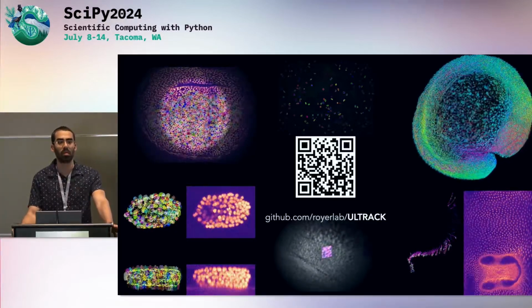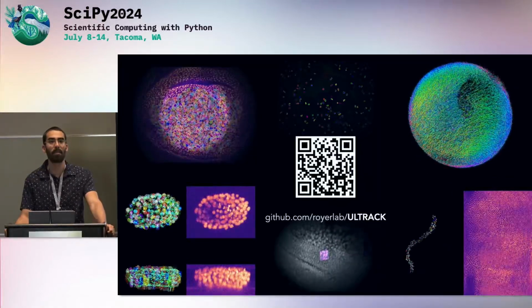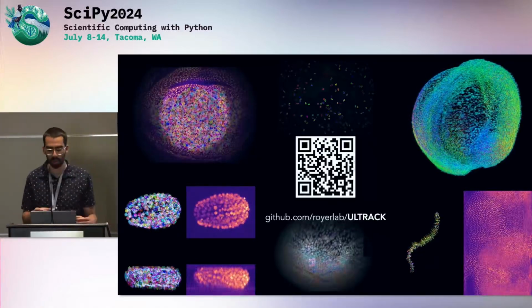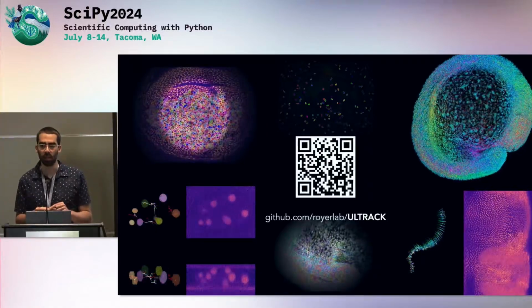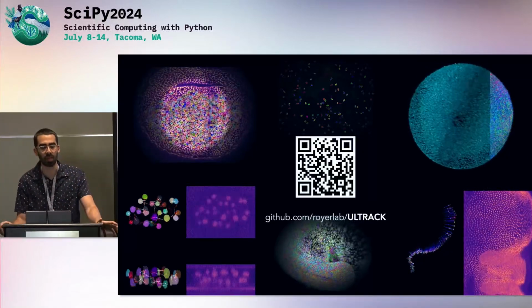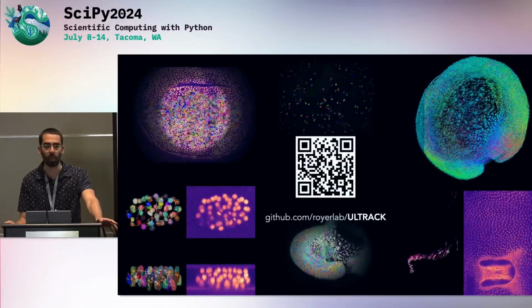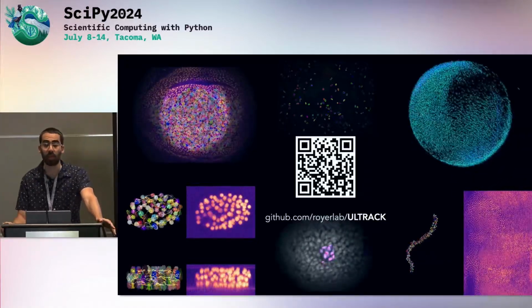Does Ultrack have support for segmenting other types of cells, like oblong cells, like myotubes? Yes. When you go to cells that are very thin, you have a 1D segmentation problem, which can be a problem sometimes. In this case, you need a better input. If you have Omnipose or Cellpose labels, it should work. But using the image intensities can be a bit more challenging, unless you have very high resolution.